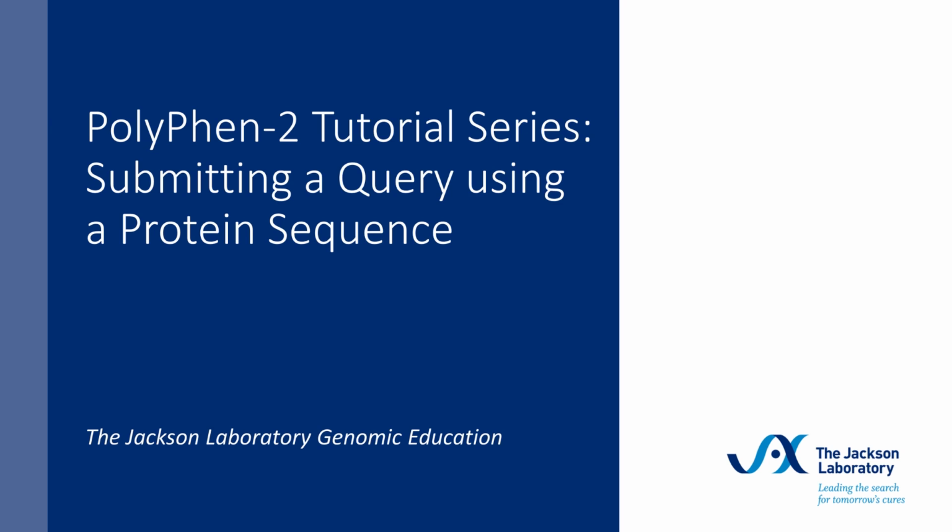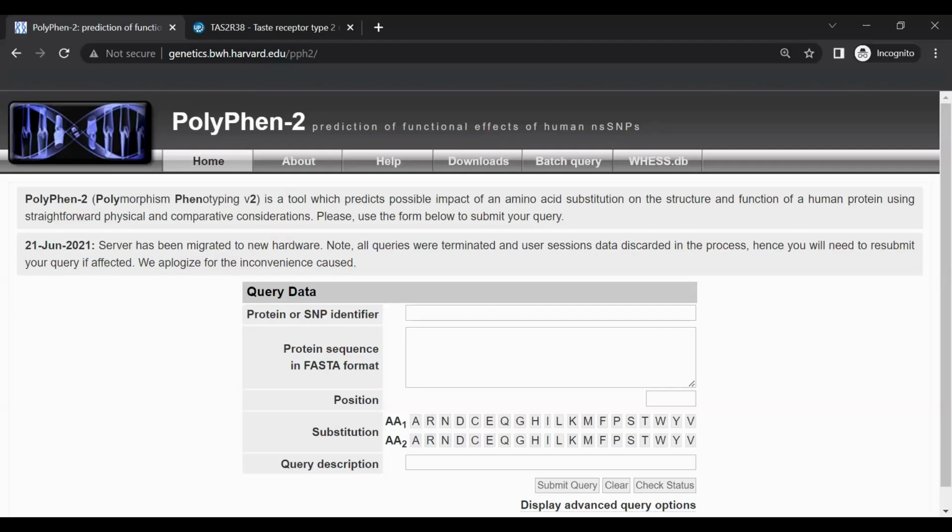This short video will demonstrate how to submit a query for a variant in a human protein to PolyPhen-2 using a protein sequence in FASTA format. FASTA is a specific text-based format for representing nucleotide and amino acid sequences. To begin, locate the submission form labeled Query Data on the home page of PolyPhen-2.